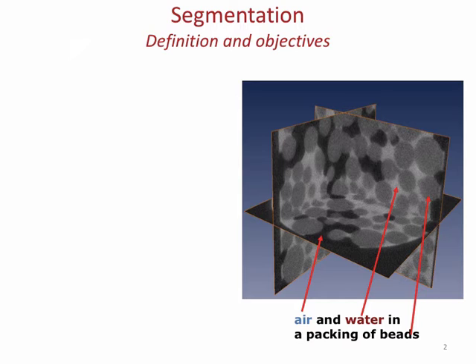Now, you might have noticed already in some of these images that it's going to be necessary. Let's say that my segmentation, whichever algorithm I decided to do, results in something like this. Okay, I can obviously see that these are misidentifications because of the noise. So I have these small objects that I might want to remove. And I can simply go by size and say, well, pick these small isolated regions and remove them and sort of convert them to the opposite phase.